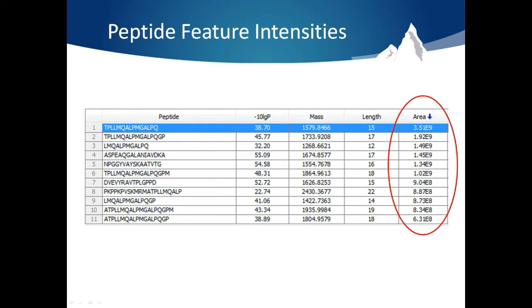We ran a subset of the data through PEAKS. What's great is that we're able to generate similar results with one click of a button. Sorting the peptide table by feature area gives you a clear idea of the most abundant peptides in the sample.